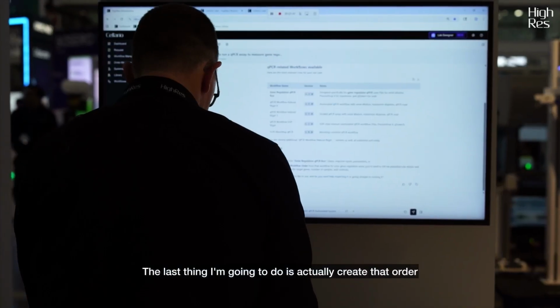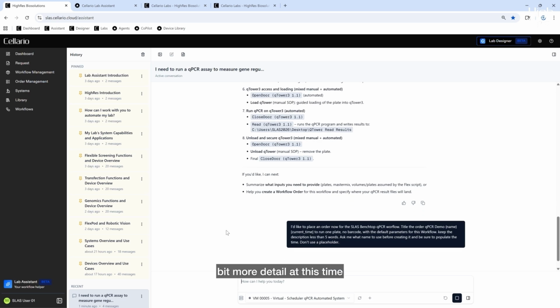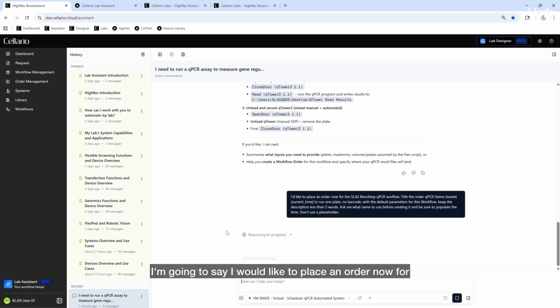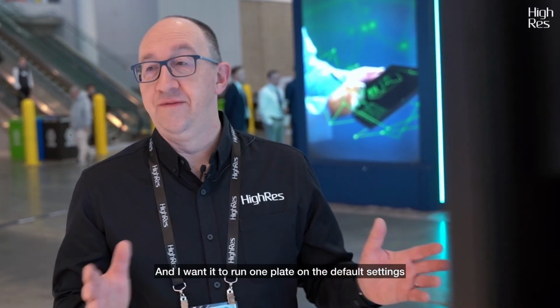The last thing I'm going to do is actually create that order. So now I can use another prompt with a little bit more detail in it this time. I'm going to say I would like to place an order now for that particular workflow. I'm going to ask it to give me a title in a moment, and I want it to run one plate on the default settings.